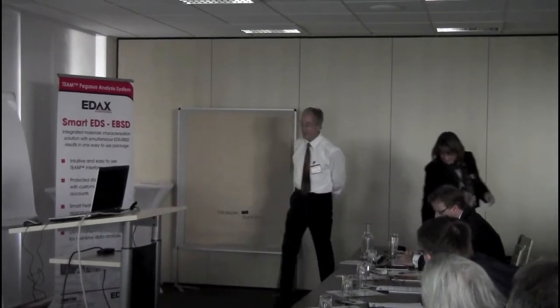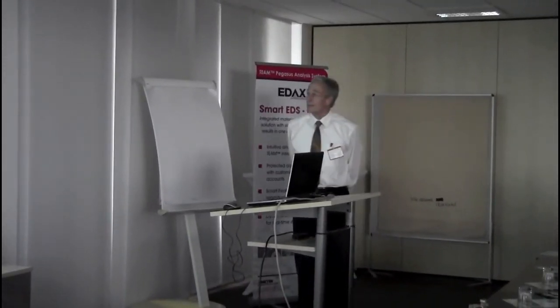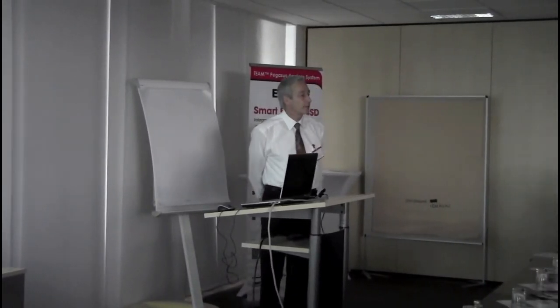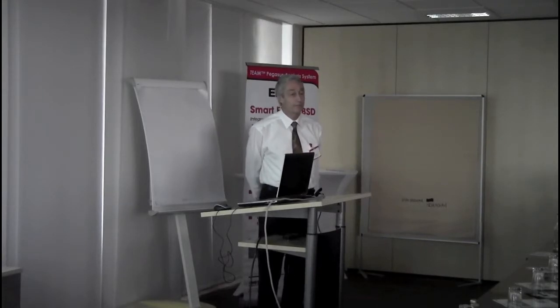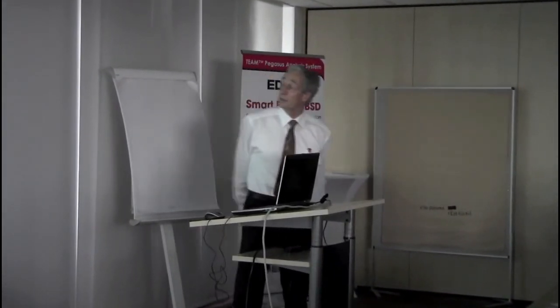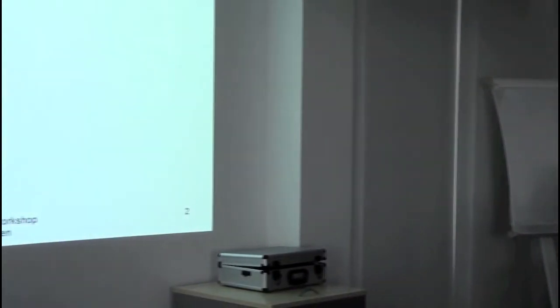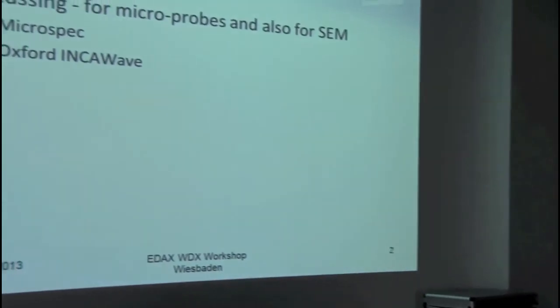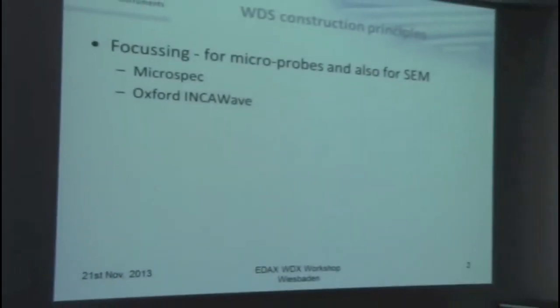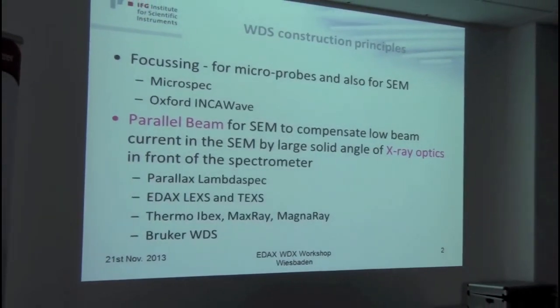Thank you for this kind introduction and also for inviting me to give this talk. It was already said that we have in principle two types of WDS. The one is the focusing WDS, which we find in the microprobes, and that's also available for the scanning electron microscopes as Microspec or now with Oxford Inca Wave. And the alternative construction is the so-called parallel beam WDS.